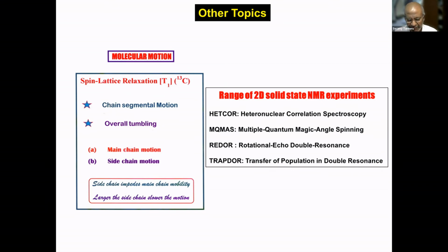Actually, in dipolar decoupling, we are irradiating the proton frequency using a second channel. That's why the dipolar decoupling takes place. Instead of completely decoupling, if you recouple some of the information, where the nuclei are allowed to recouple, we have additional information which is not normally possible from routine techniques. Because of that, solid-state NMR has become a de novo technique in current research, straight from molecular, macromolecular, supramolecular, and biological systems. So this technique can be used for mapping the structure and geometry.